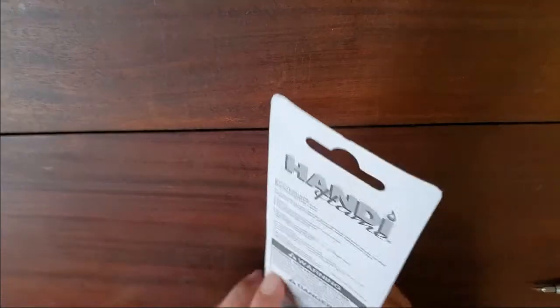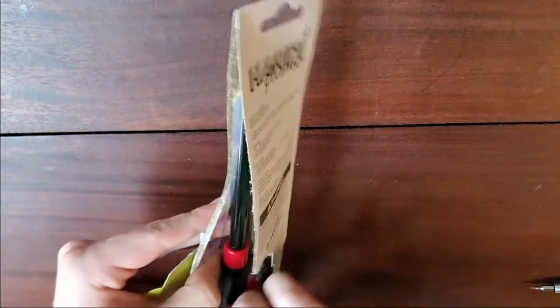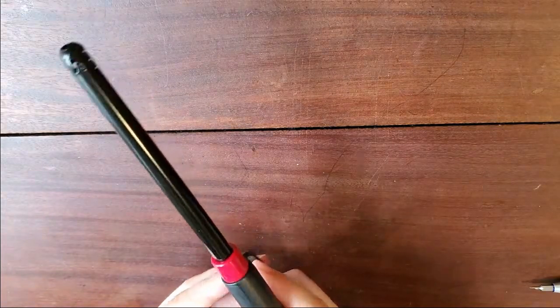You can just open it up — it's just a normal lighter. There's a control on here for the level of the flame and a light.